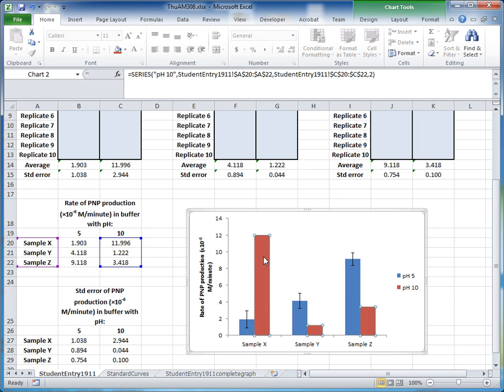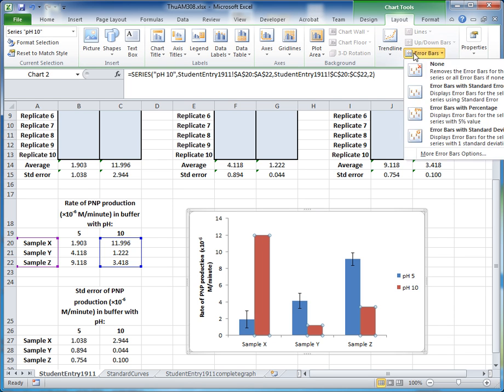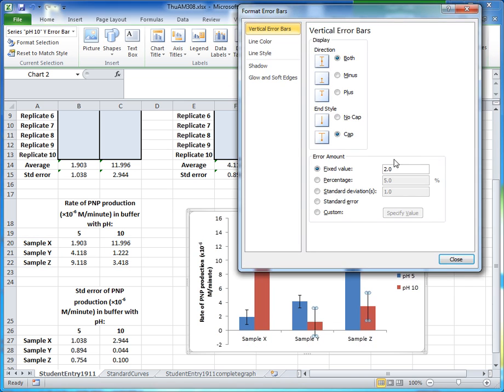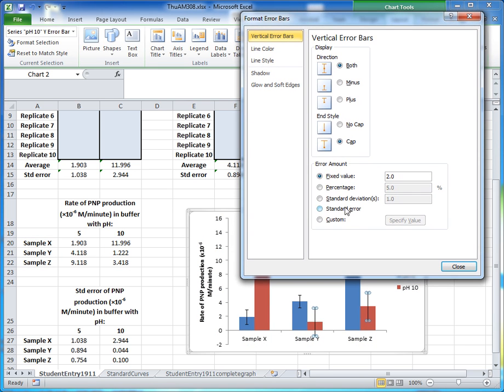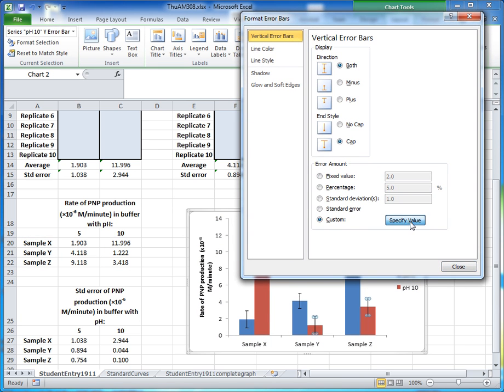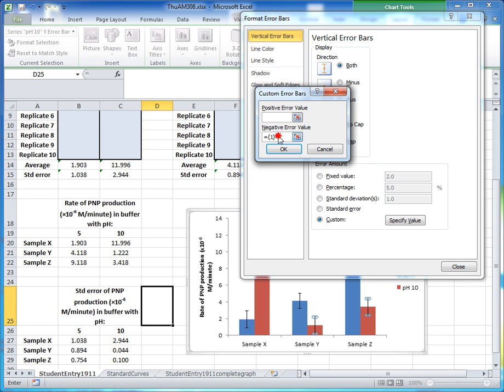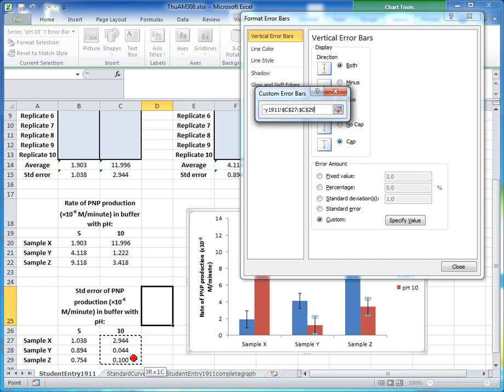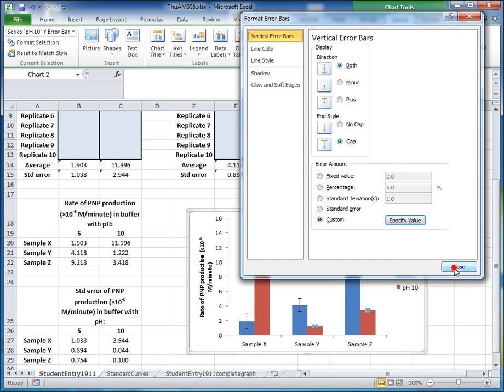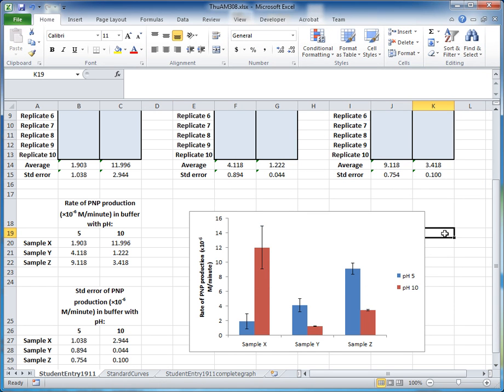To add error bars for the pH 10 series, click on the pH 10 series, go to Chart Tools Layout, select Error Bars, then More Error Bar Options. In the dialog, select Custom, click Specify Value, clear the boxes, then select the three positive error values for pH 10 and the three negative error values as well. Click OK and Close.